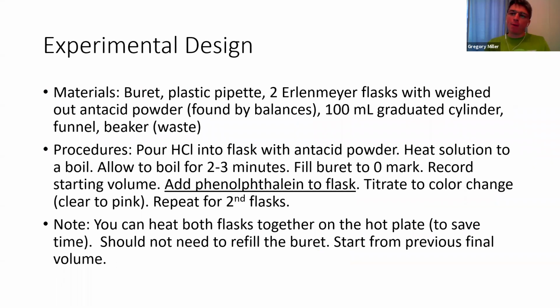Most antacids, if you Google it, work through neutralization, but they also work through a buffer system. And without getting too much into what a buffer system is, buffers resist changes in pH. So if we want the HCl and the NaOH to react together for our titration, we need to make sure there is no buffer in our system. Most of the time, the buffer that's created is a carbonate, bicarbonate, carbon dioxide buffer system.